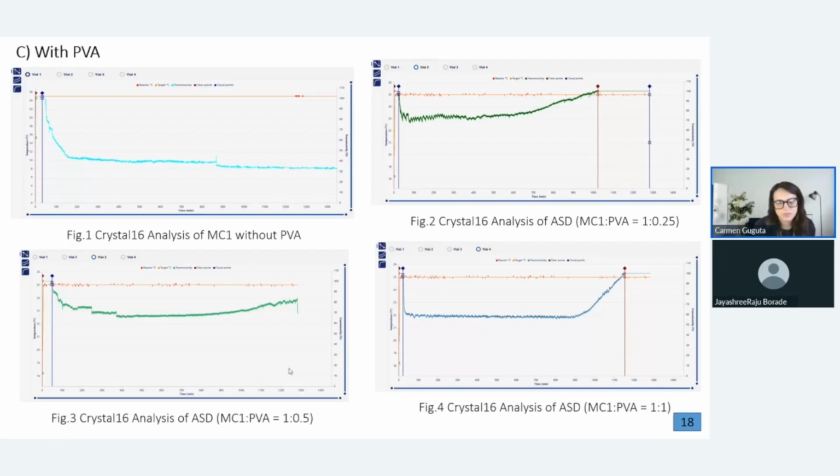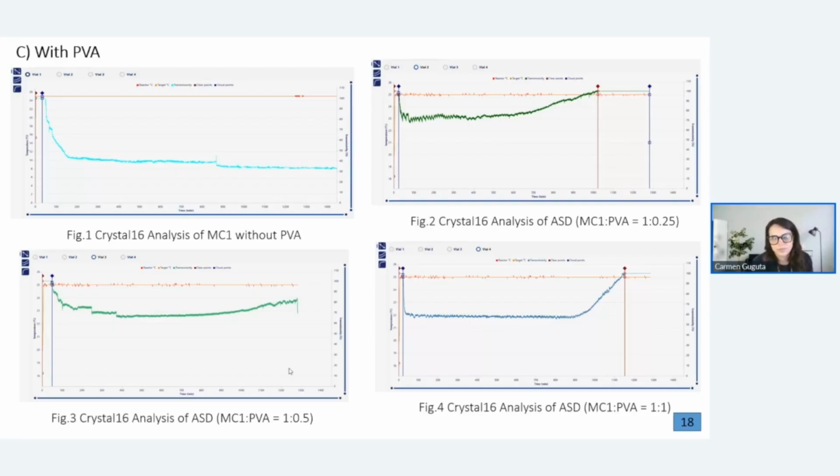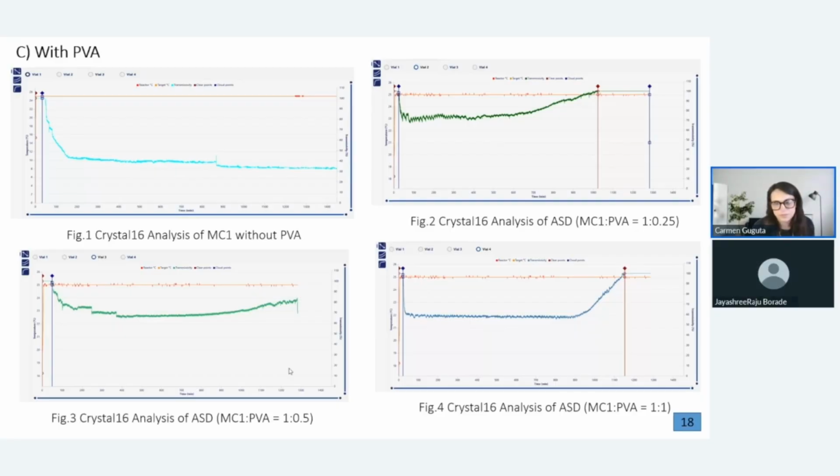If we want to stay with the same polymer, we can also change the surfactant to move the LOC. That's another way we can manipulate it. Those would be the strategies. There are also combinations of polymers that can be used, because anything which changes the system can potentially change the LOC, and it does.